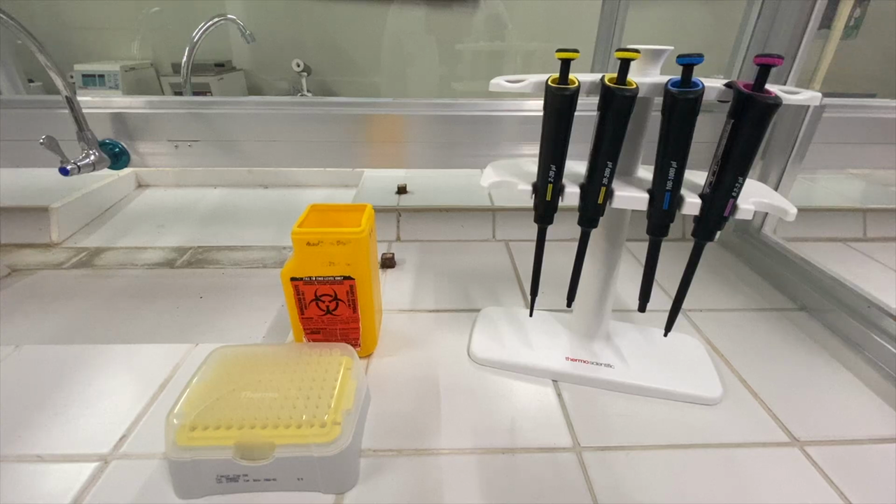Hello class, welcome to our virtual activity on how to use the micropipette for molecular procedures. So in this video, you will learn the proper pipetting techniques appropriate for the solution that you will be using. So we have here micropipettes on a rack with different sets of volume ranges.